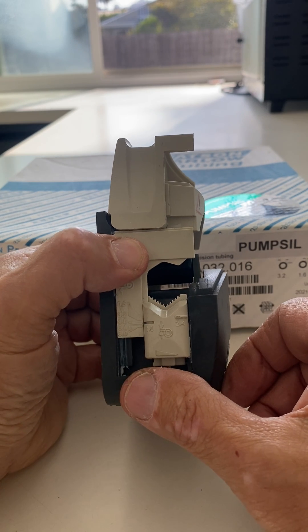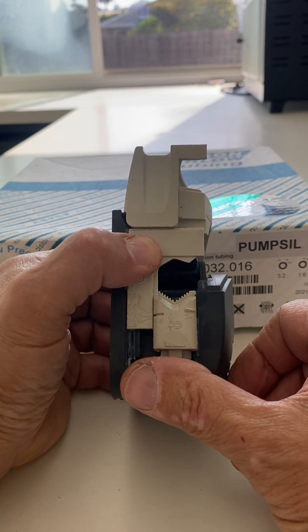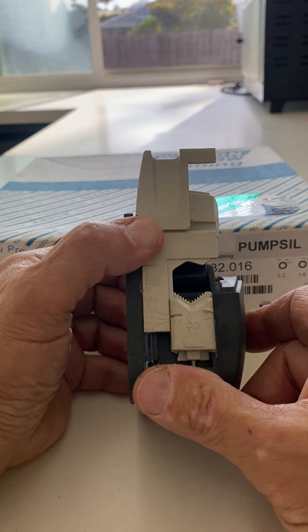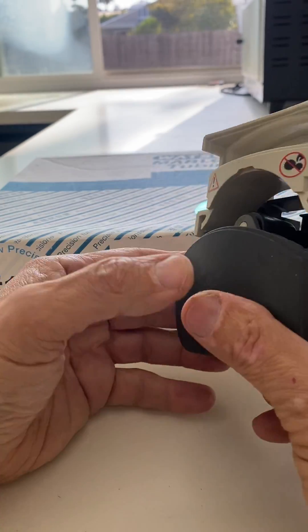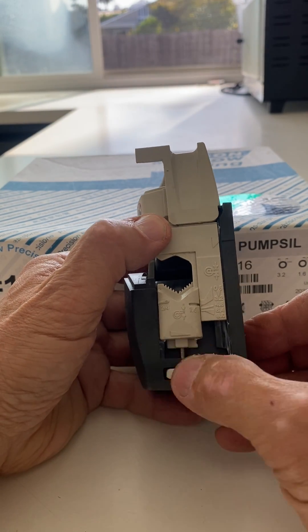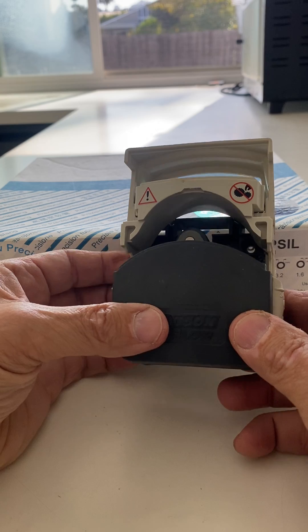you use these knobs on either side of the head and you align this hash mark with 3.2. You do that on both sides and you're done.